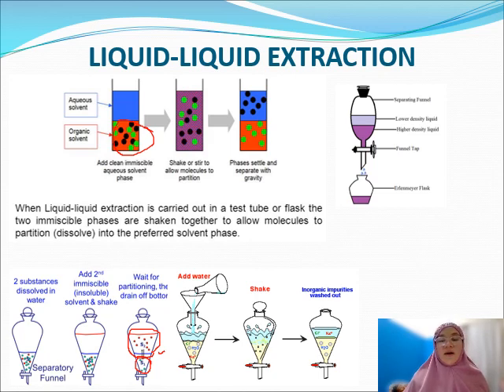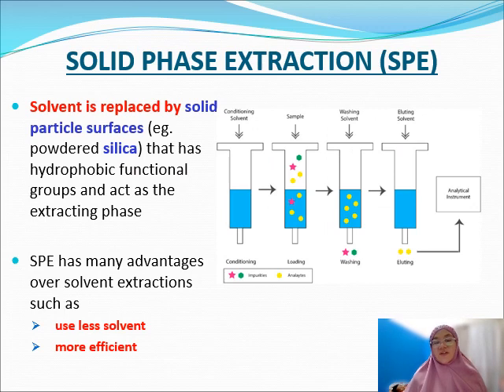The phases will separate by gravity. The water holds the polar components, and the non-polar components are in the organic solvent. So this is liquid extraction.